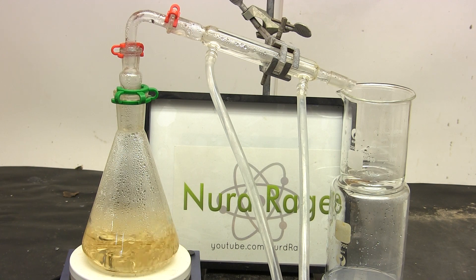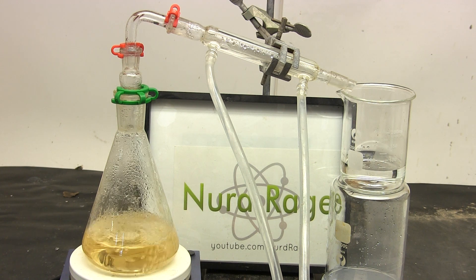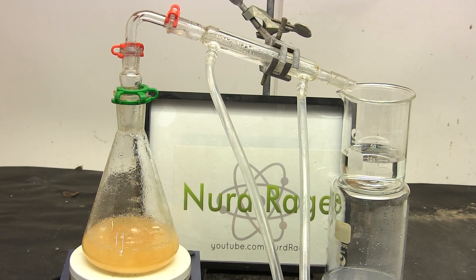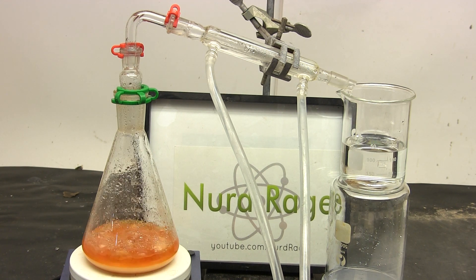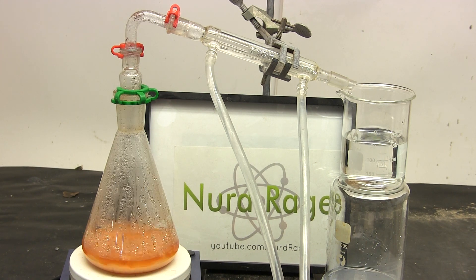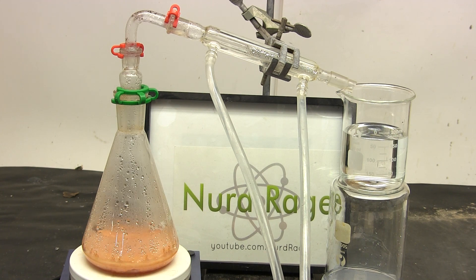The reason we went through the trouble of cooling and filtering the sodium sulfate crystals first, instead of just distilling directly, is because there's so much sodium sulfate that when it starts precipitating during distillation it will actually insulate the solution above it and greatly slow down distillation, sometimes even stopping it. So we removed as much as we could beforehand with chilling and filtration to make our later distillation smoother and more manageable.